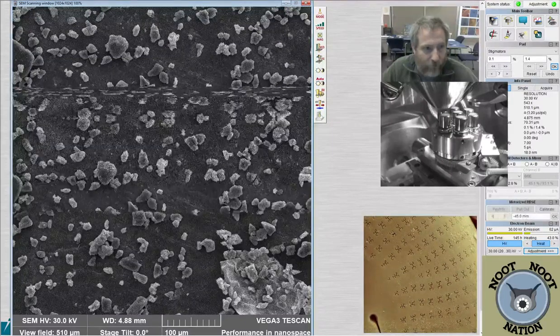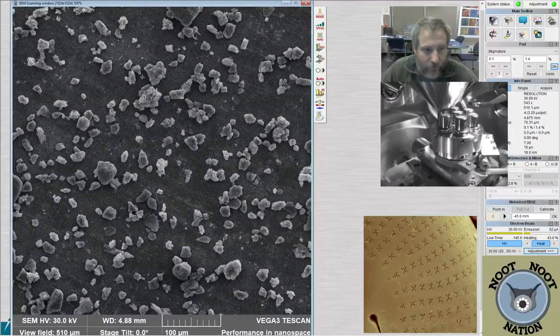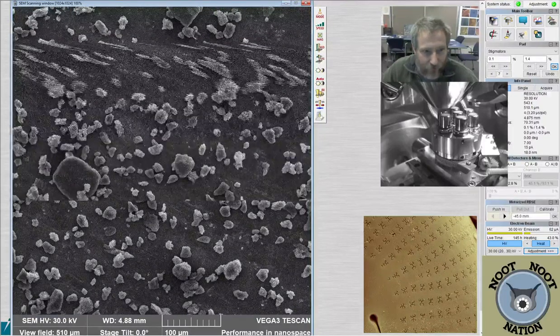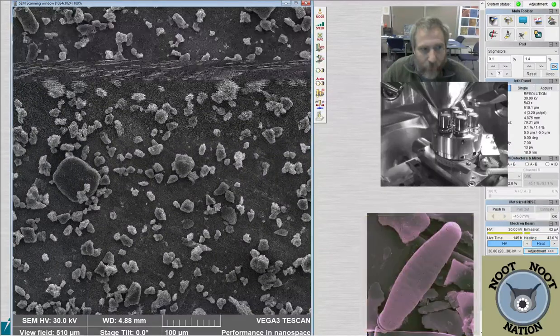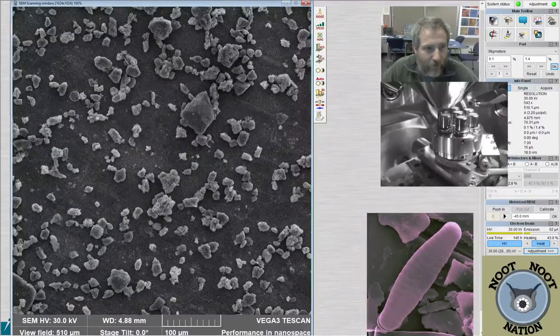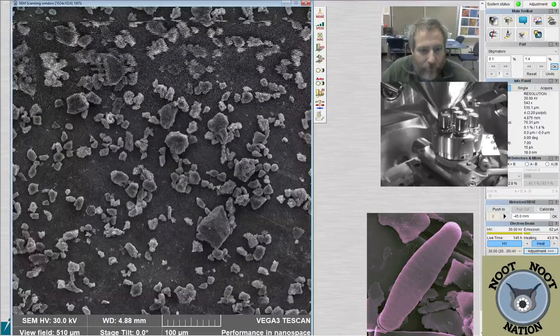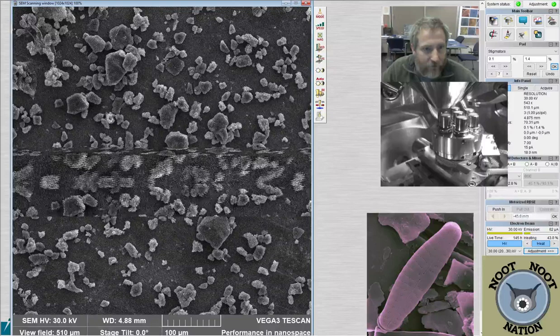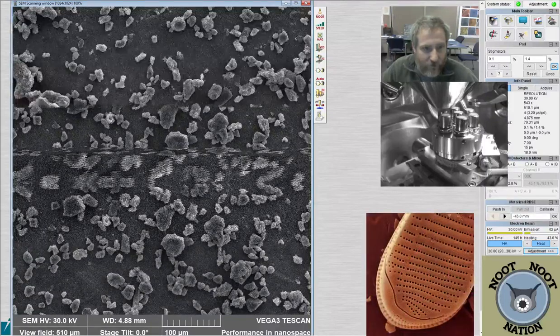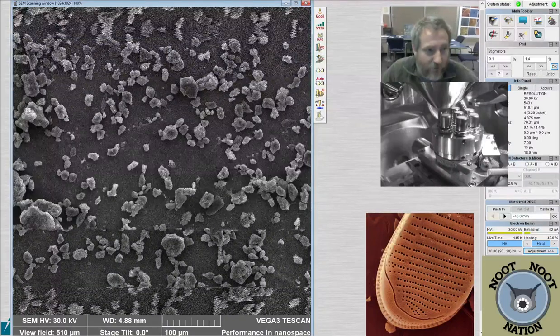So when we vacuum off the water, it preferentially gets rid of those that are really tiny, and hopefully we don't vacuum off any tiny diatoms, but if we do, it's probably okay to get rid of some diatoms in order to salvage the fact that we would be able to see everything else.